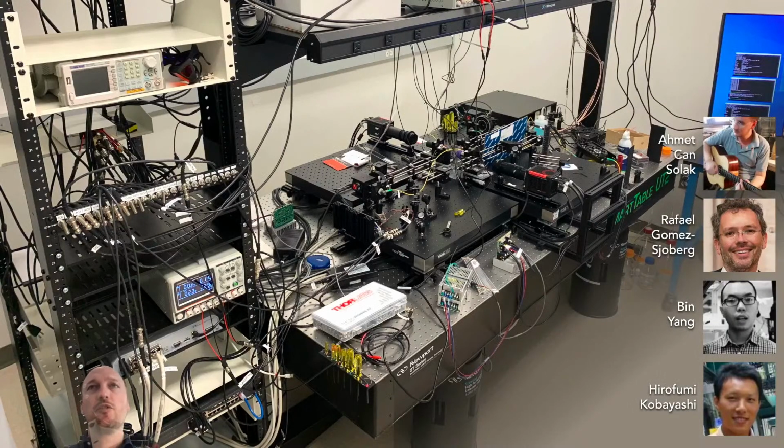So if you look at a 2 detection and 2 illumination objective microscope, this is what we have at the Biohub. This was built in the last 4 years, the first 3 years of the lab, and then we've been using it routinely for the past 2 years. Very, very nice machine, and we use it every week, but it still has some limitations in terms of sample mounting, and we wanted to facilitate that.